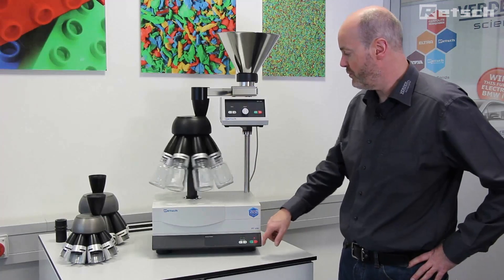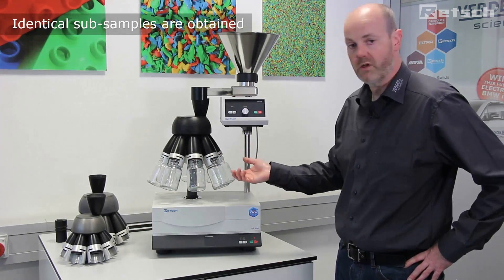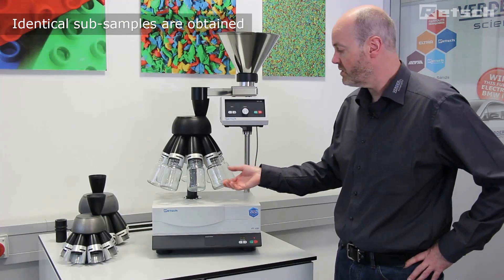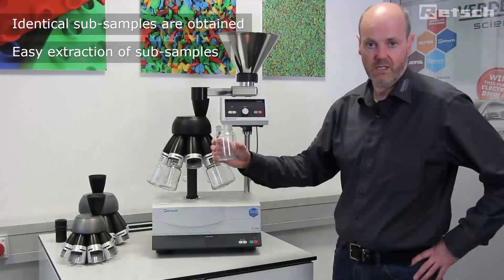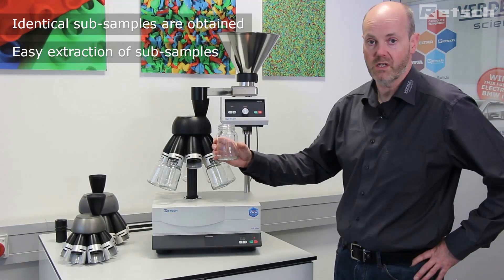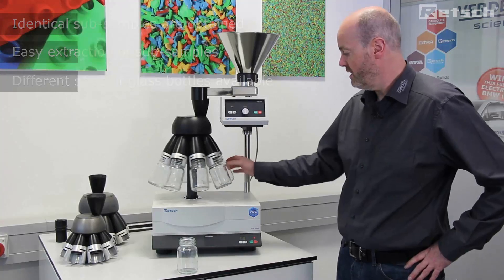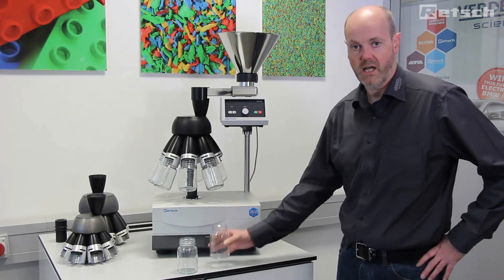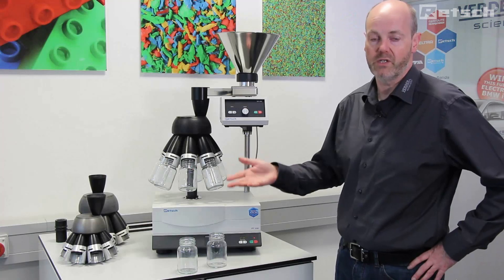Therefore, at the end of the division process, we will end up with eight individual and identical subsamples. These can simply be collected into removable glass bottles of different sizes — one taken forward to analysis, and a second held as control. The rest, if not required, can be returned to bulk.